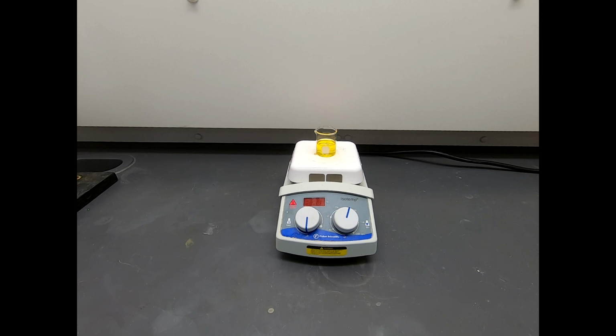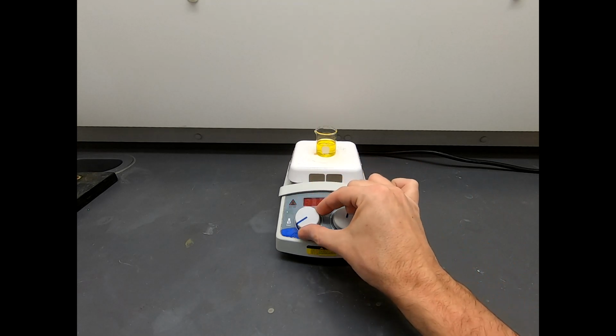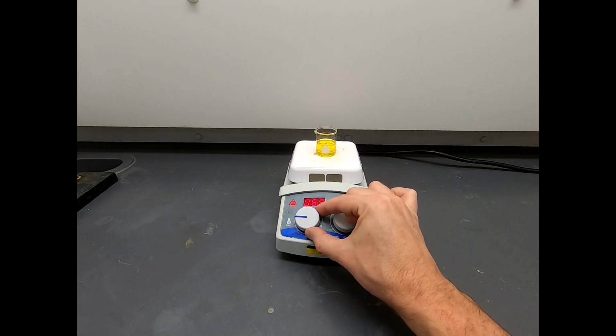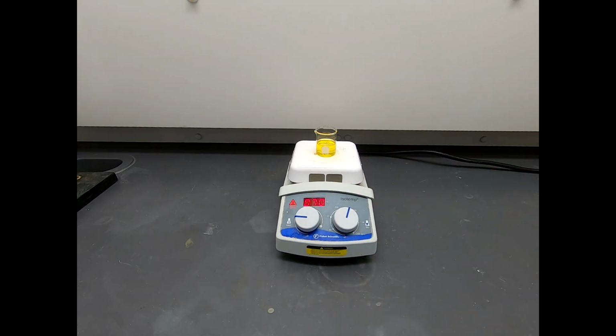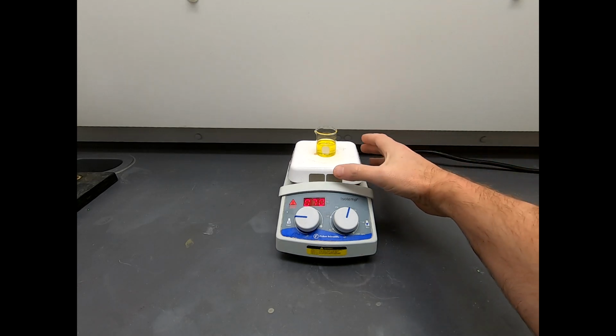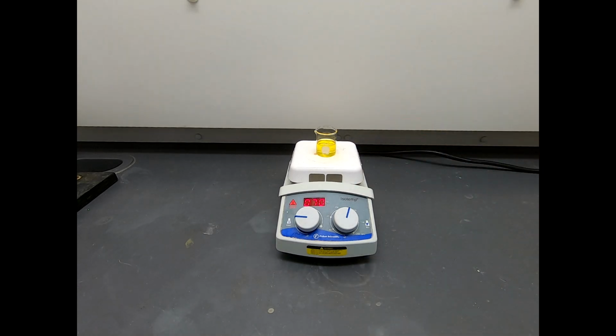And this reaction now is just going to sit and stir. And I'm actually going to heat this up a little bit. I'm going to warm this up to about 70 degrees on the stir plate. I don't have my watch glass handy, but I will put a watch glass on top of this. And I'm just going to give that a little bit of thermal encouragement, 70 degrees. That's 70 degrees on the hot plate. It's probably not getting to 70 degrees in the beaker. I'll just let this warm gently, and we'll let this heat overnight, and we'll come back, and hopefully we'll have a nice change waiting for us.